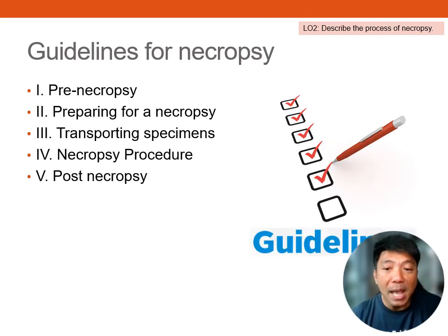There are several steps to follow in the necropsy process, starting from the pre-necropsy phase through to the post-necropsy cleanup. These steps ensure that the procedure is carried out systematically and safely. We will go through each of these steps in detail, from pre-necropsy preparation to specimen collection, transportation, and post-procedure cleanup.